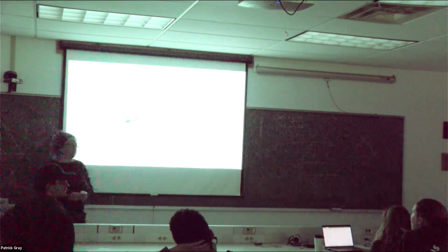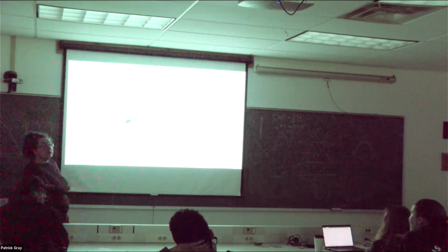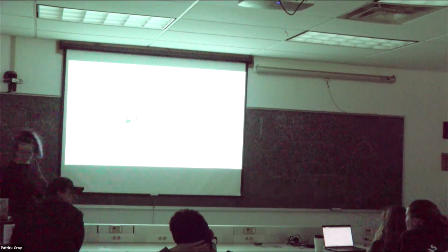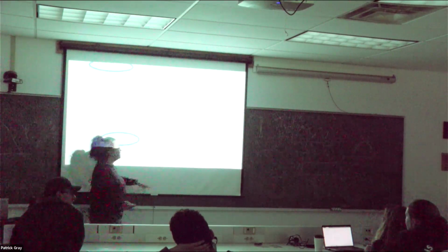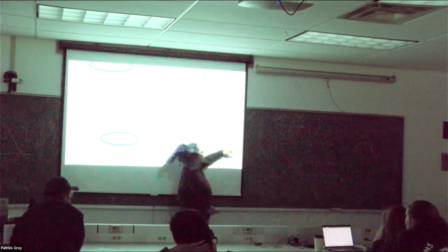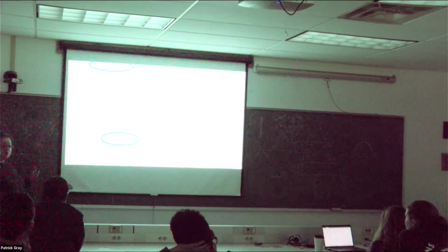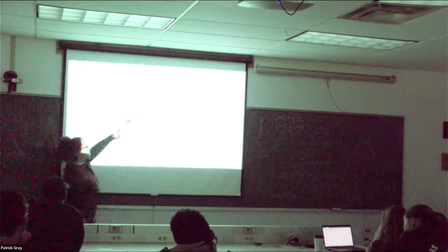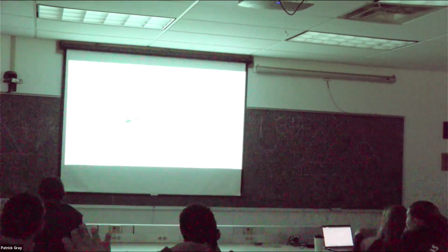So this figure just tells you whether the fluorescence is overestimating or underestimating. It's telling you, are you actually measuring only chlorophyll or are you picking up some other stuff? Because we know that we have a limitation in fluorometric measurements of extracted chlorophyll because of the presence of either phaeophytins, degradation pigments, or other chlorophylls. We can't make this detector window so narrow, we just cannot. So we have certain errors, and in certain situations, depending on the phytoplankton community structure and the presence of different chlorophylls, you're going to see these trends where your fluorometrically derived chlorophyll deviates from the truth.